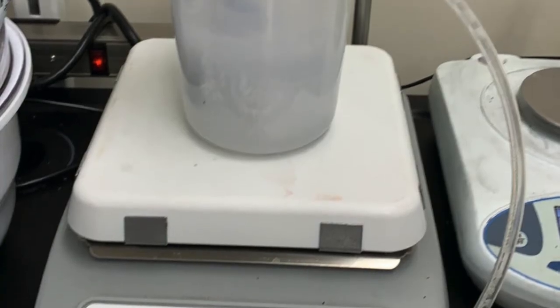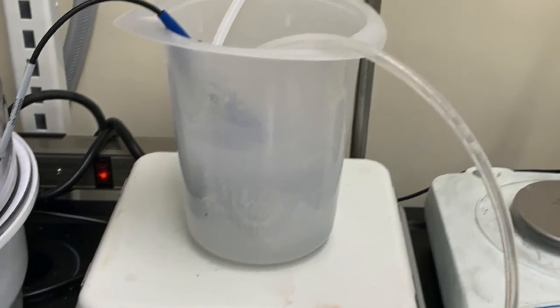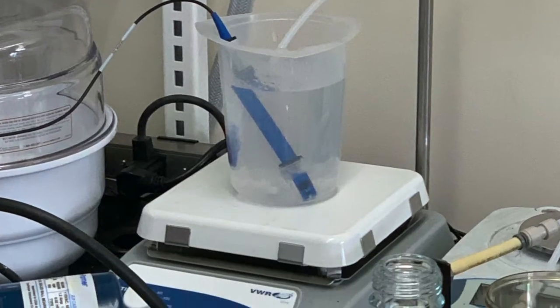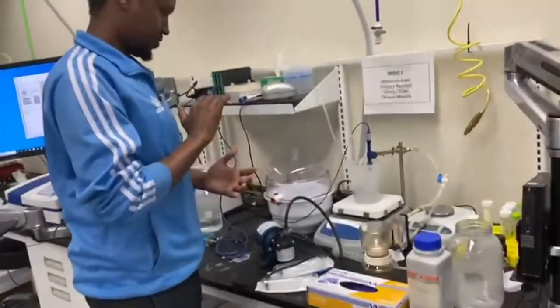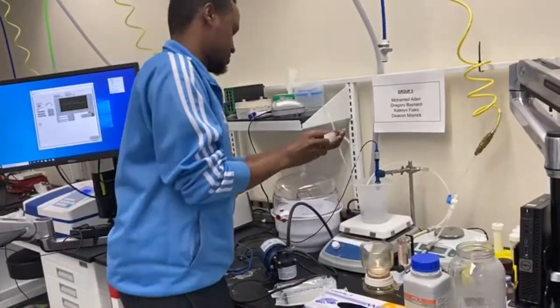For this experiment, we used starting pH of 8, 10, and 12, and measured the rate at which CO2 was captured over an 8-hour period. Our reactor was set up to be filled with 800 milliliters of water, set at our desired pH, which we measured using a pH probe.